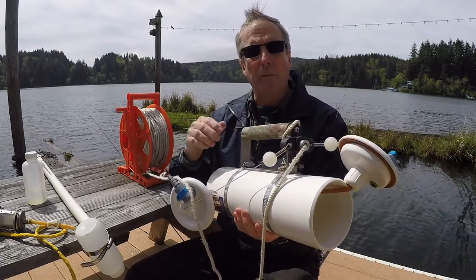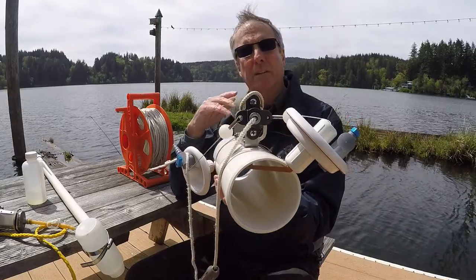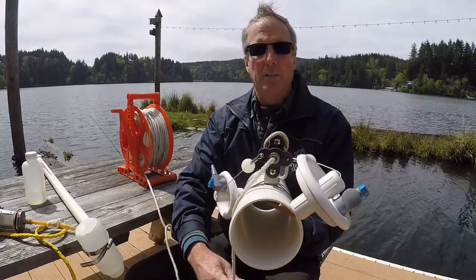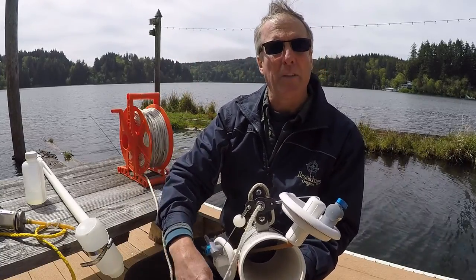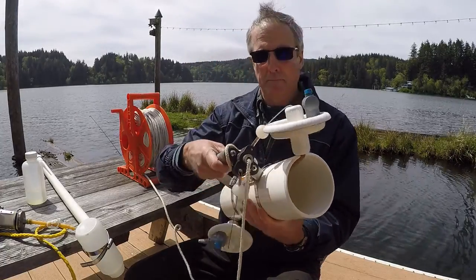It'll change in and out as it gets lower. So that's the whole theory behind this, is that the bottle is open all the way down until whatever depth that you want to take your water sample. So then the question is like, okay, you've got your bottle down there. How do you close it? And that's where these pins come in.